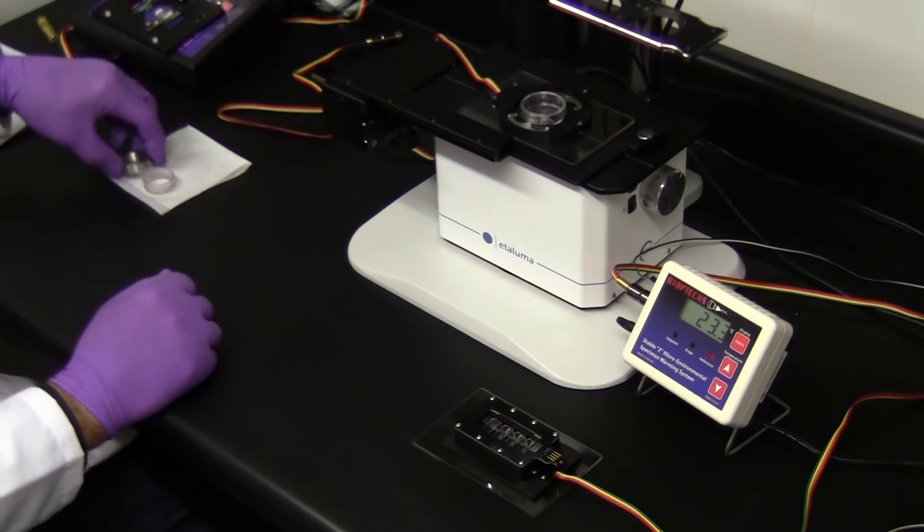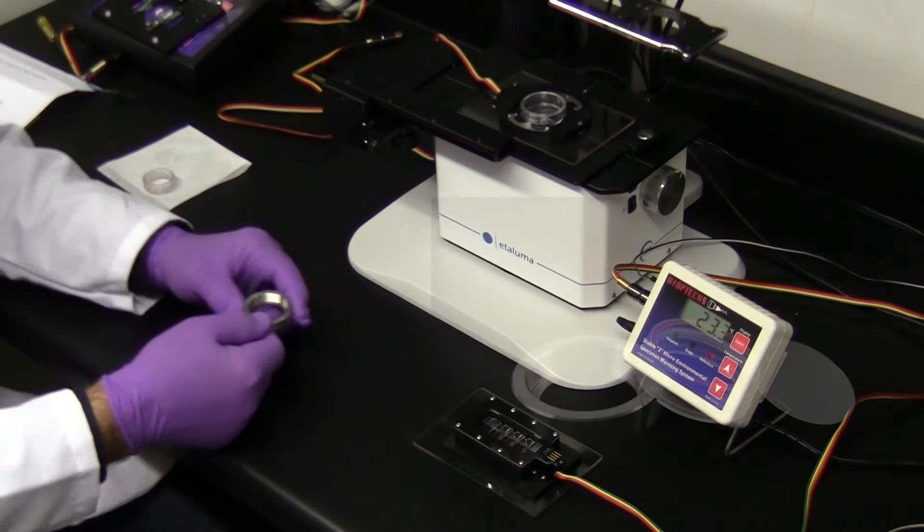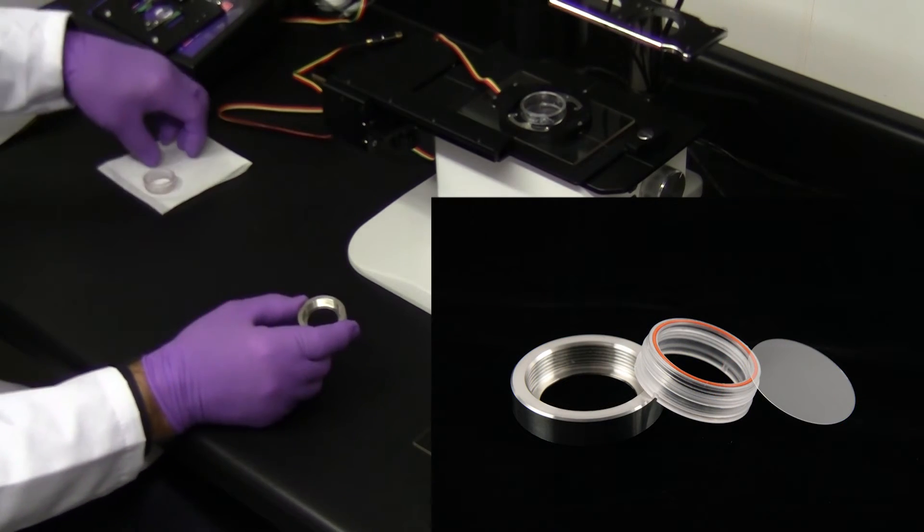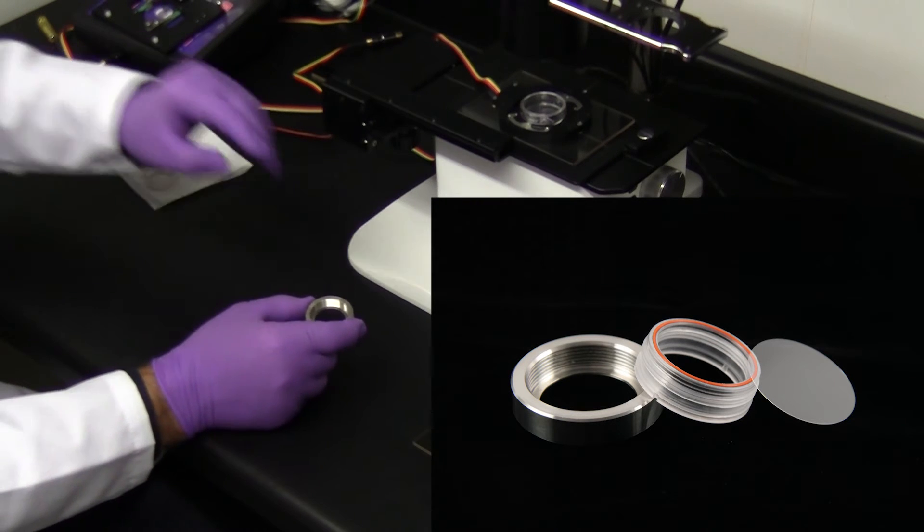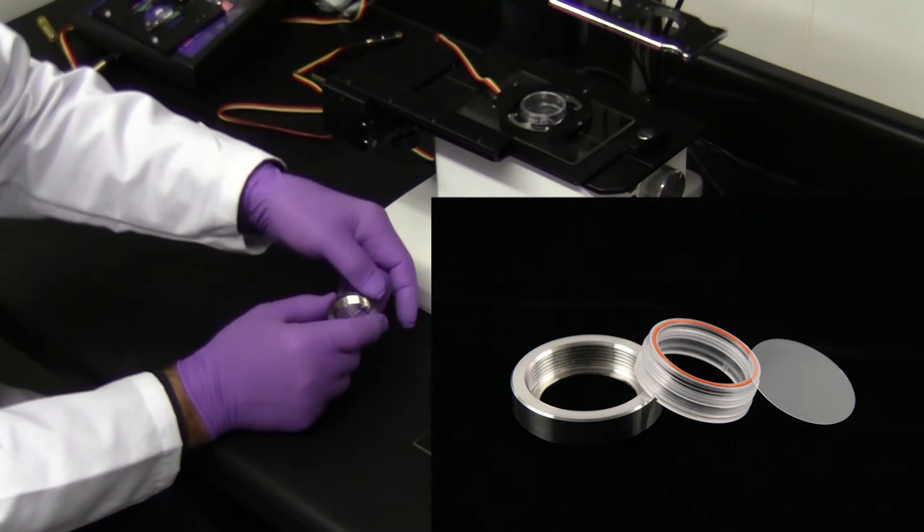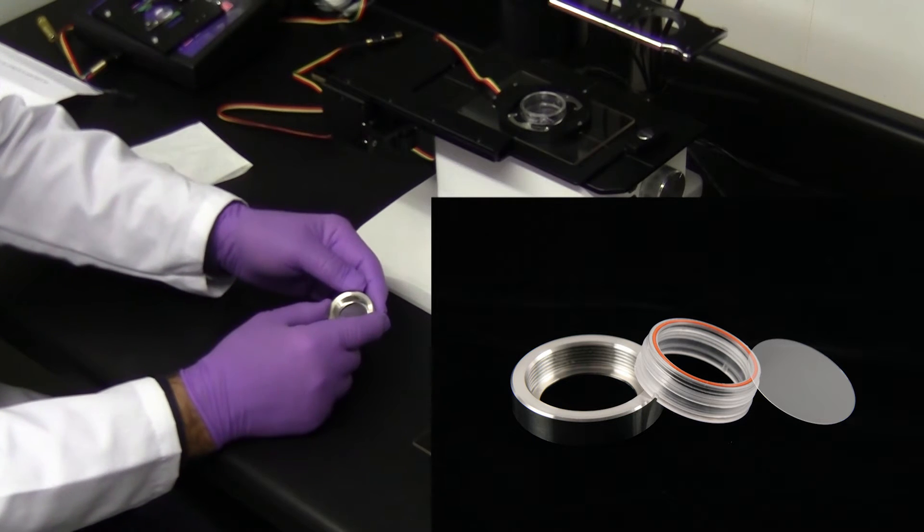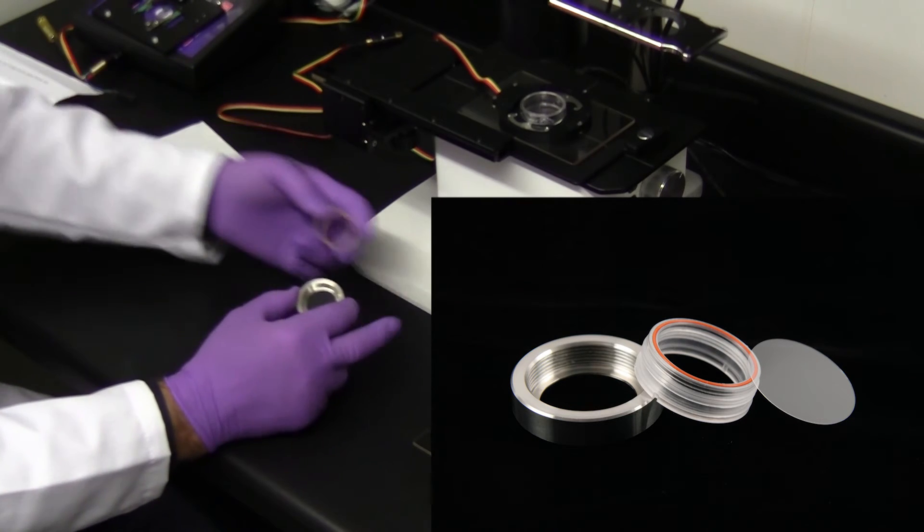For customers that want to save on cover glass bottom dishes, we offer an interchangeable coverslip dish. It is made of a stainless steel threaded outer ring that holds a 30mm diameter number 1.5 coverslip and has a 25mm viewable aperture.